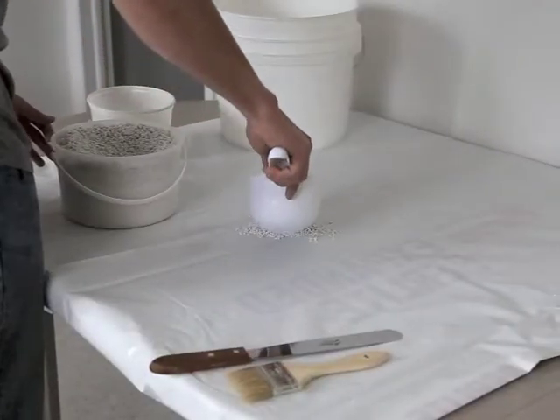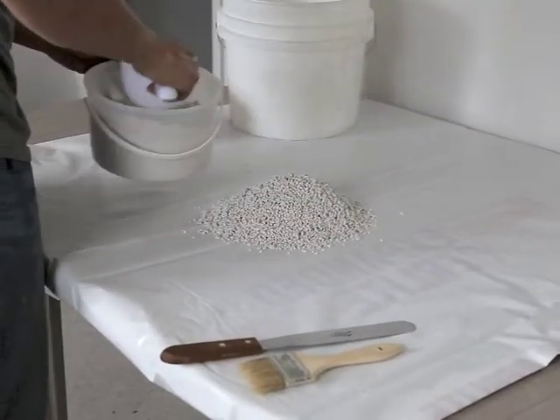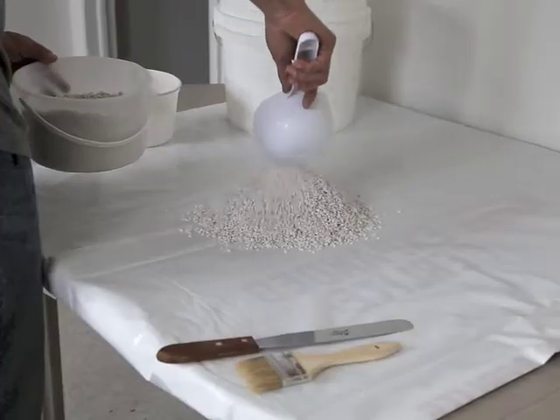Pile the sample in a cone shape by placing each scoopful or pouring each bucketful at the center of the cone so that the perlite will disperse equally in all directions.